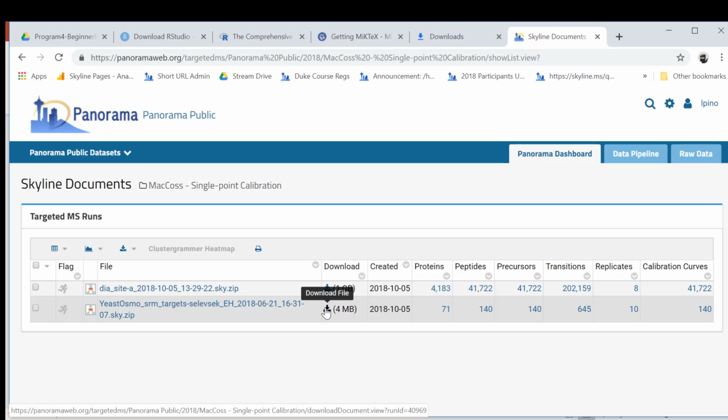Yeah, I did not have any problem. I have not only the raw files, but the converted MZMLs. And it took some time to upload, as you might imagine. But other than that, I did not encounter any limits yet.